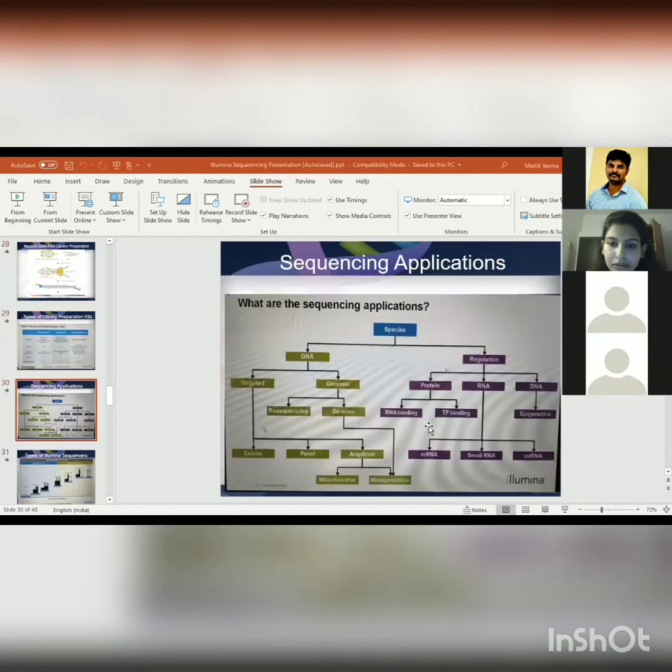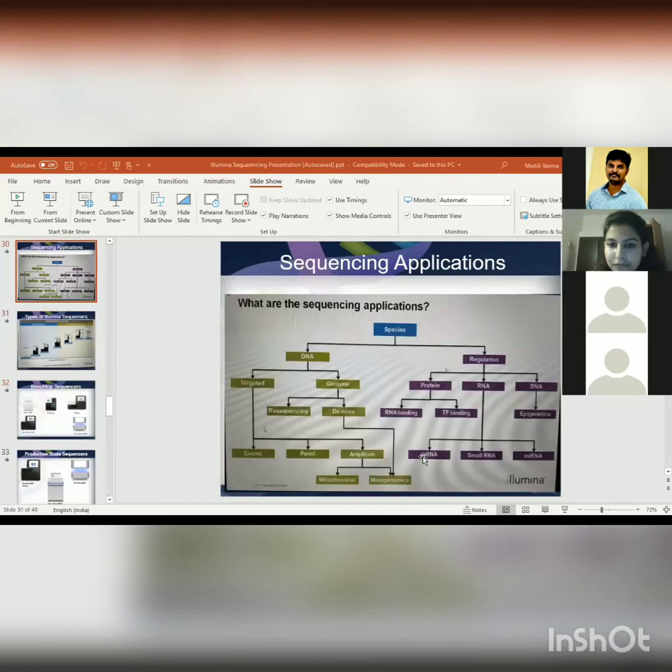So I wish to know, you said somewhere about total RNA sequencing. You're talking about the applications, right? I was talking about the protein, RNA, and DNA interactions between them, and that can be found out by sequencing the RNA and DNA. I was talking also about ChIP-seq.